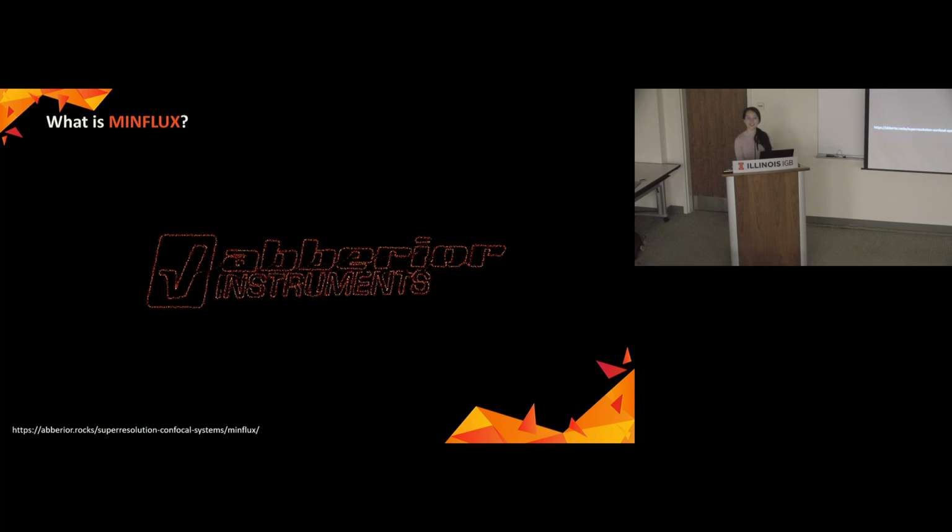Okay, so this is a video from their official website. I don't know if I should pay them to play the video or they should pay me to promote the video. So from the video, we can see MINFLUX is a very powerful imaging system that we can use for high resolution confocal image as well as single molecule super resolution tracking. And it works in the living cell as well.